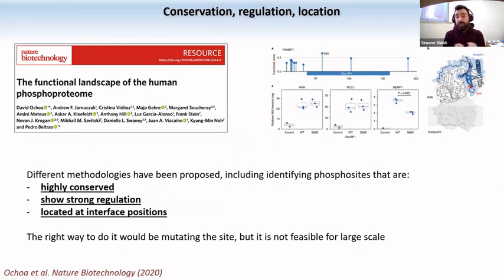So whether they are present or not, they might contribute to creating or destroying a protein-protein interaction. Based on this, they came out with a very interesting score, but it might not be suitable for your specific interest, and you might not be interested in phosphorylations. It might easily be that you are working with another type of modification.